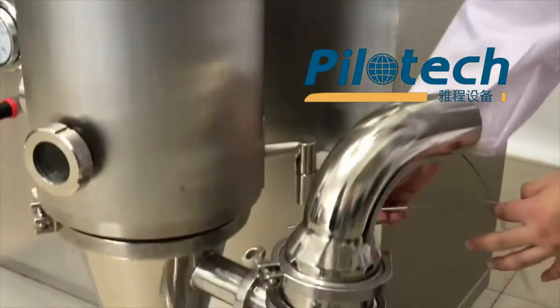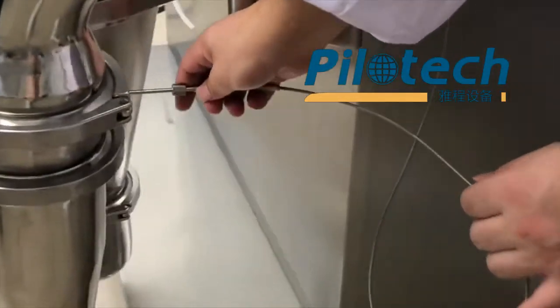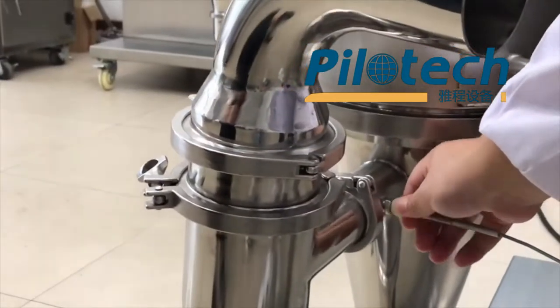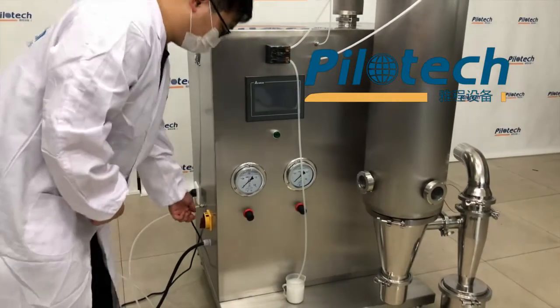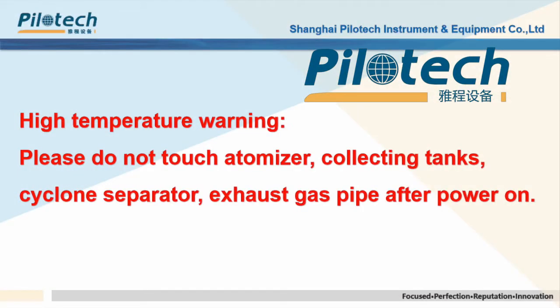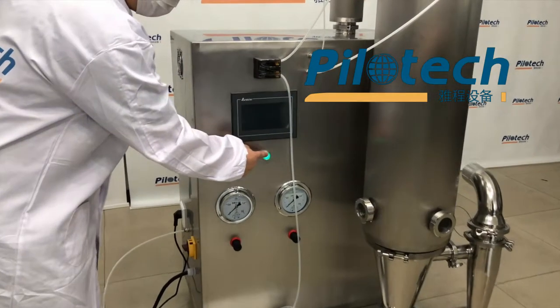Now we need to install the temperature probe. Turn on the main power switch, then turn on the touch screen.